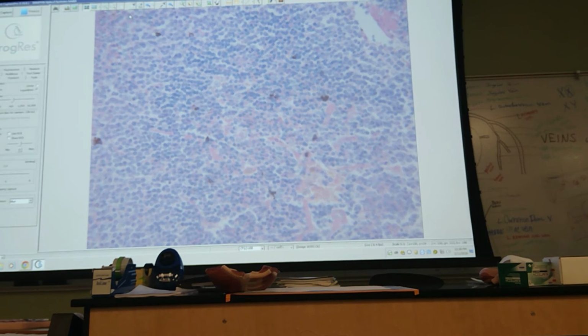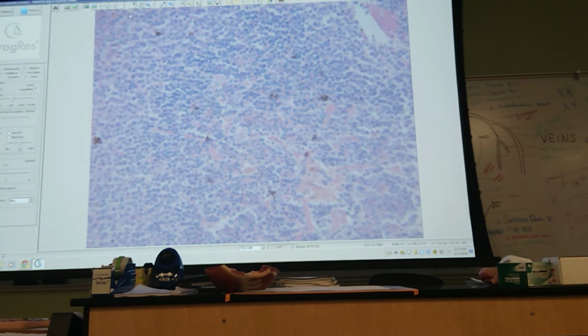What are they doing there? Chilling, waiting. Okay? We'll explain in another chapter what they're waiting for. So I like to say, they're waiting for the antigen of their dreams. Okay? We'll get to all that. So, these splenic corpuscles have lymphocytes packed in there.